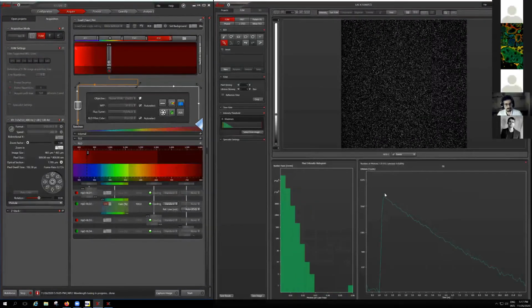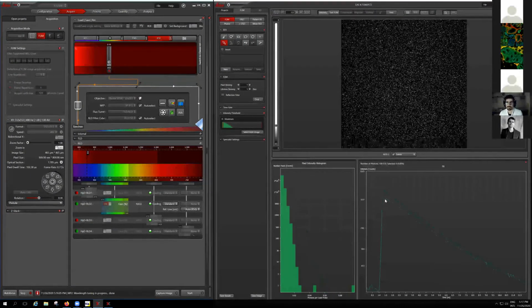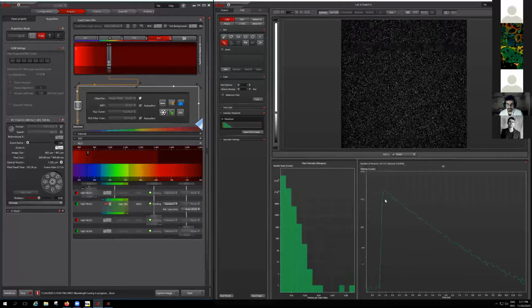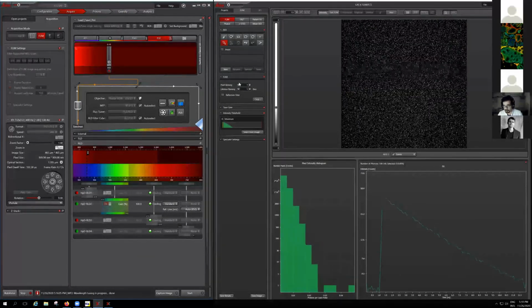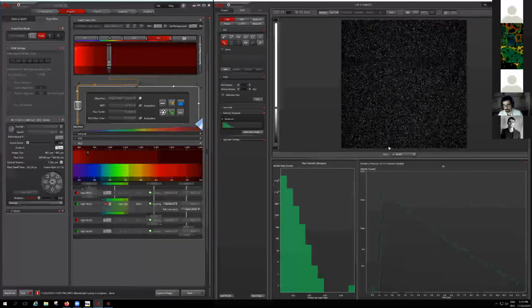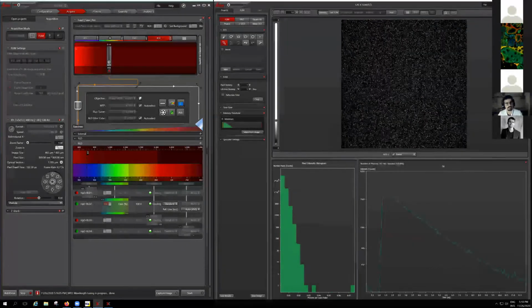What we see here is not for one pixel, because some acquisition FLIM software show you the decay curve of a pixel, or after binning on the lifetime, or pixel binning. But here what we see is the whole field of view.